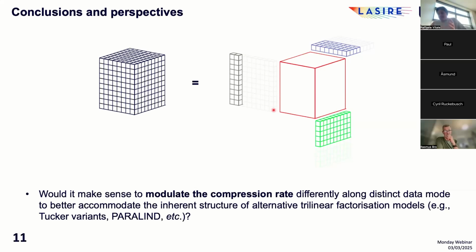Of course, sometimes when you don't have a satisfying resolution with 2, 3, 4 components, you can always try to increase the number of components until the resolution you obtain makes sense to you or can be interpreted by an expert. This is something we often do when dealing with new data about which we don't know much. That's my experience on this point. I don't know if I answered your question, Paul.